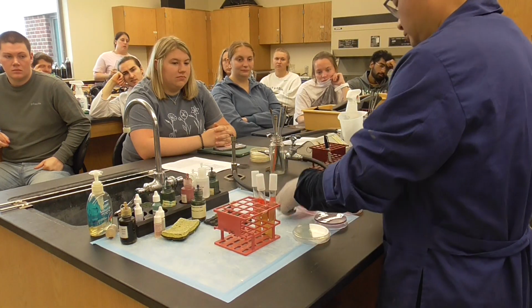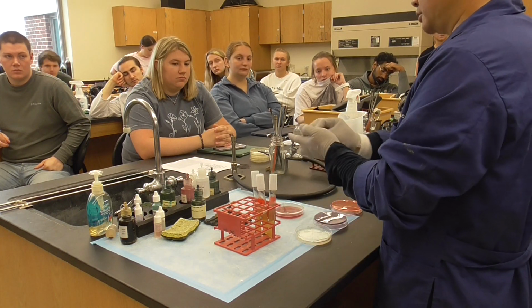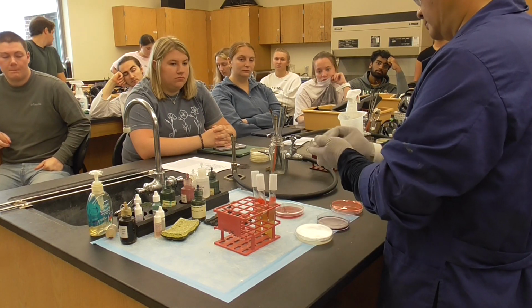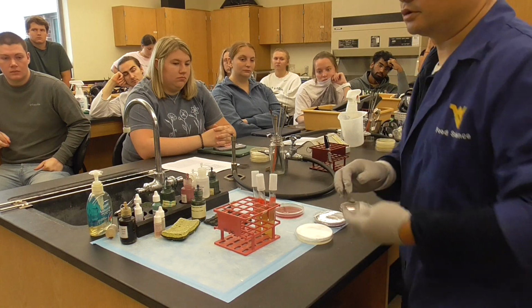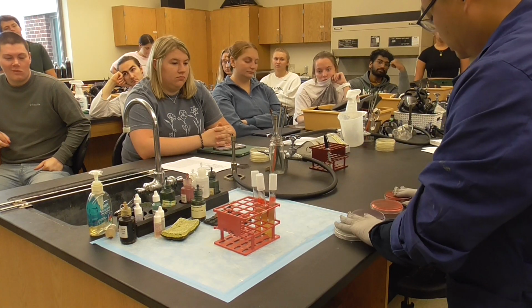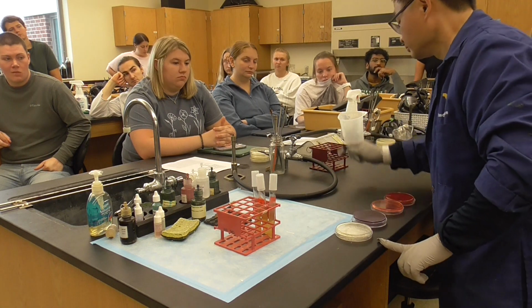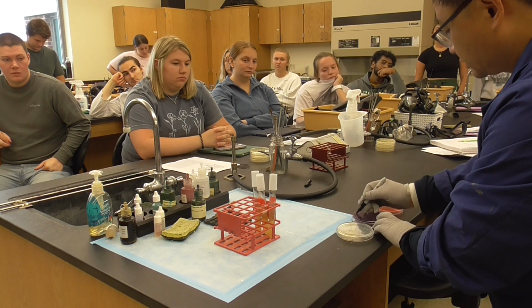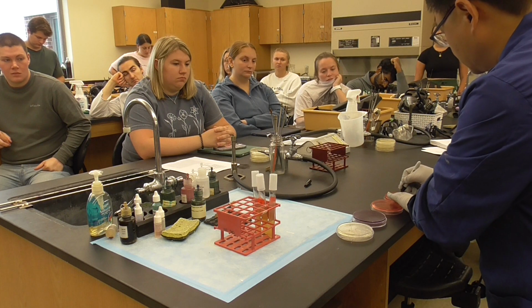Inside, I would say, you also do a little bit of drying. Okay, I'll show you an easy way to do it. This is also dry. Last one also has to dry. Okay, then you go to the biohazard trash can. Okay, have to label. Like I said, these three, everybody does individually. The blood agar, two of you share. Okay, one person does it. Split them into three sections. Three sections. Three sections. And three sections.